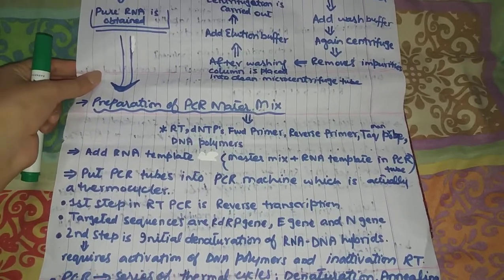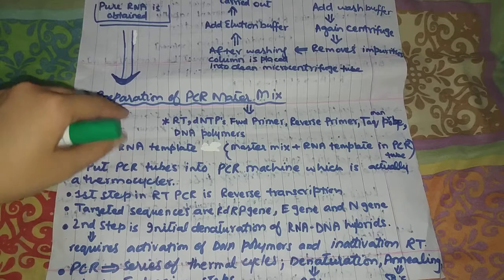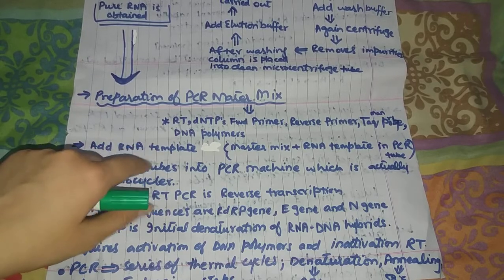First we will have to do the preparation of PCR.